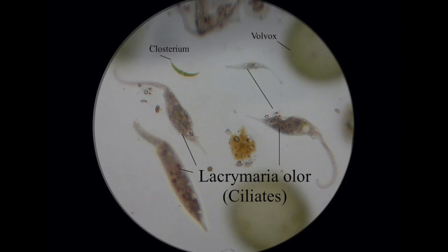These are lacrimaria — very distinctive in that they have a very pointed head and then this very long, whippy tail.